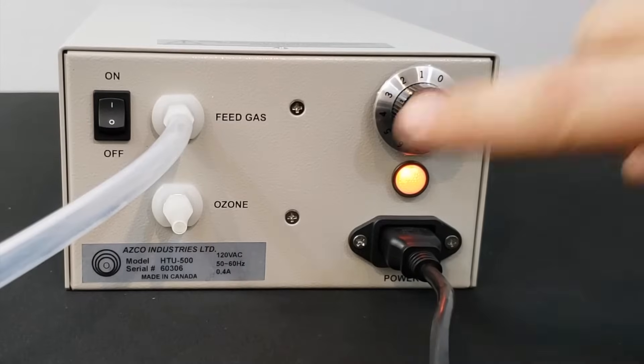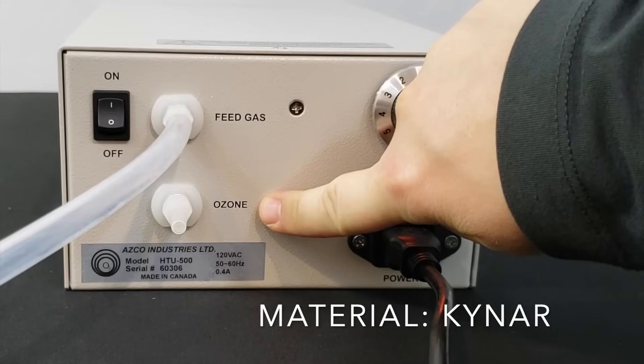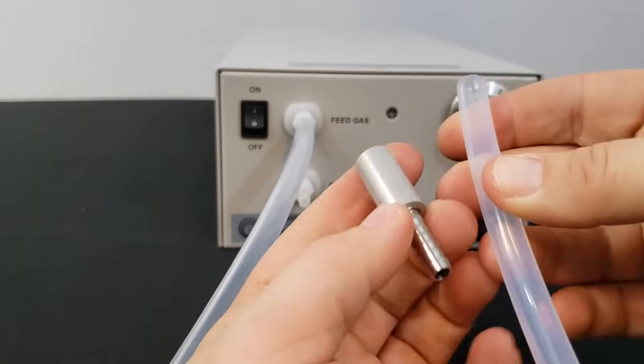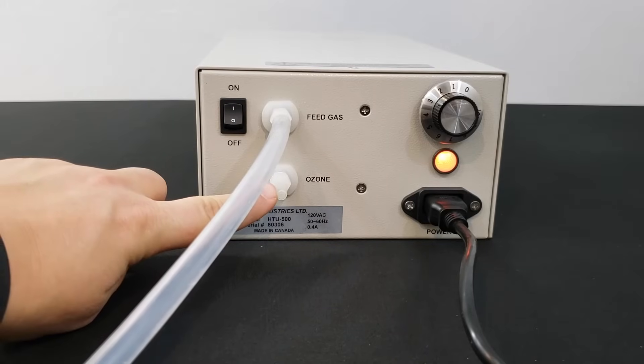The ozone then comes out the ozone outlet, which is made of Kynar and also fits a quarter-inch ID tubing. If you're injecting ozone into water, you would have tubing and a diffuser attached to this outlet — these are items that we also provide.